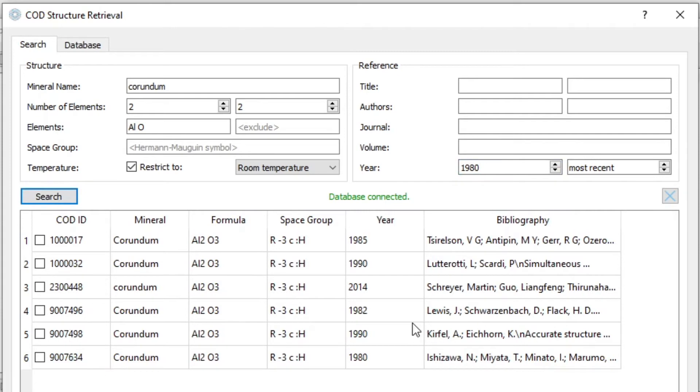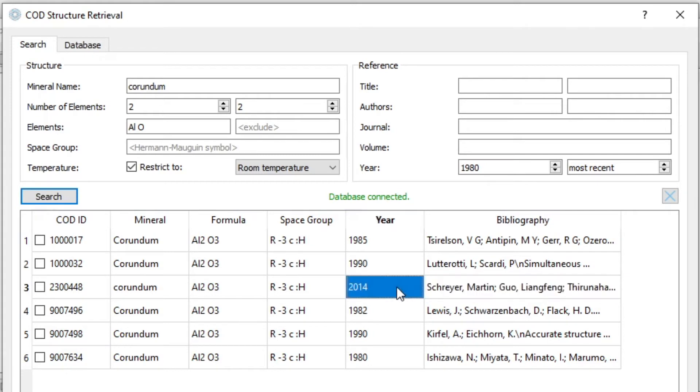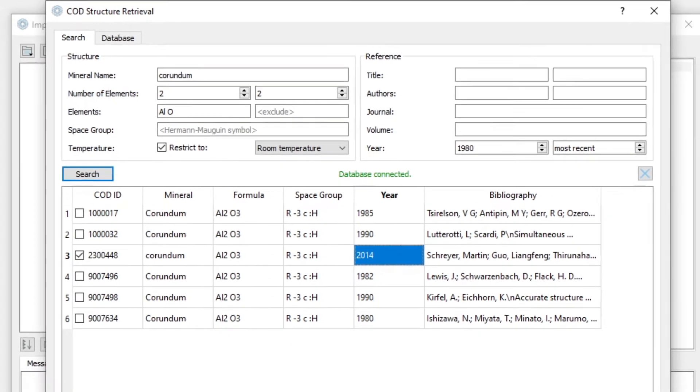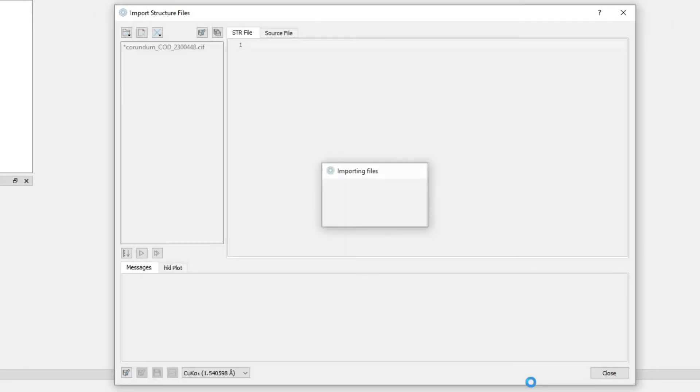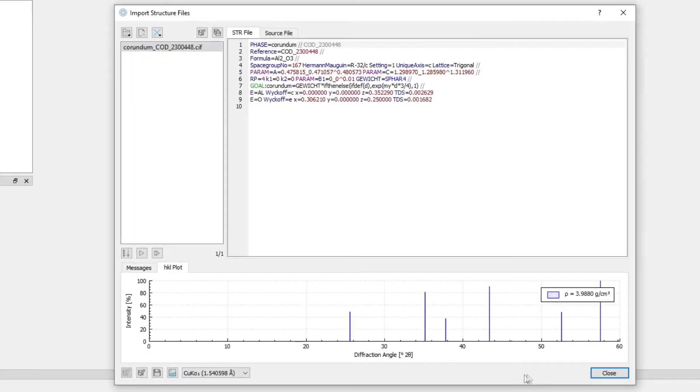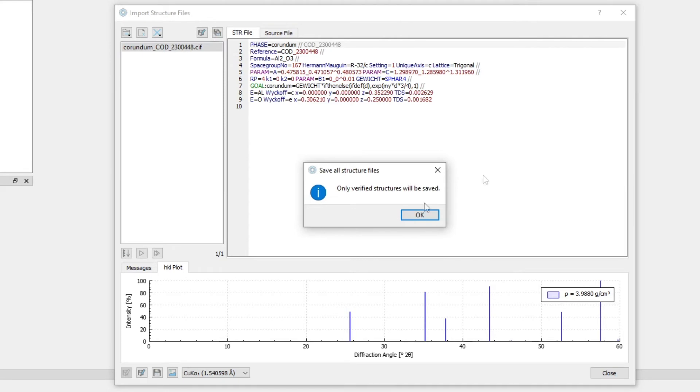If we find what we're looking for, for example, here is a pretty recent publication, 2014. We want to download this and import in Profex. We just select it here and we click OK. It will be downloaded, converted to the Profex structure file format, validated. So it shows us the peaks.